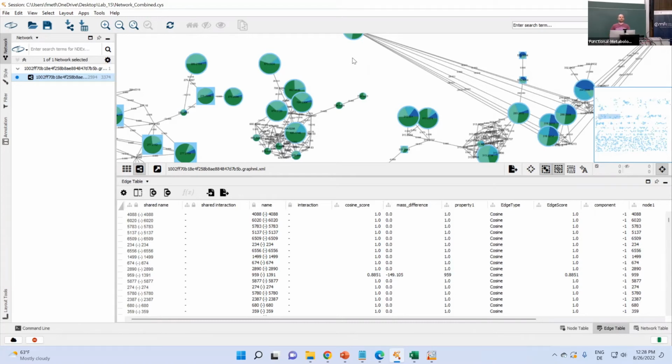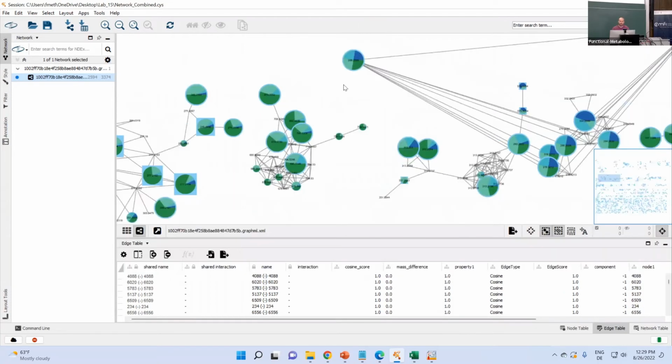Okay, any other problems? Was that the series we can do? Yeah, just import the stats file. Because for the exercise later on, this would be something I would also suggest, because that way you can actually decide what you think are the most important features.